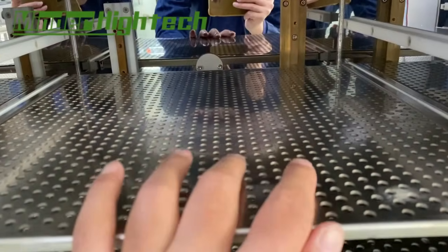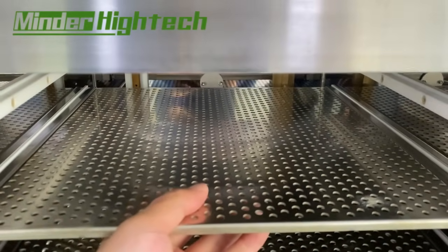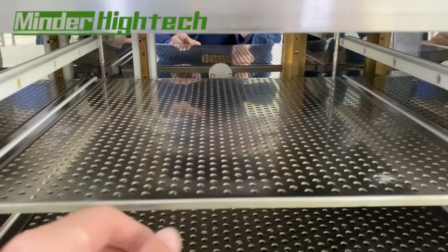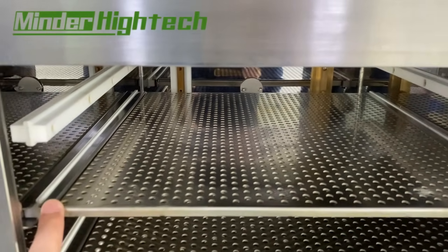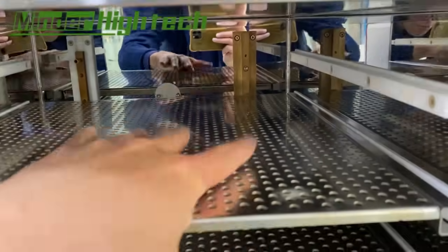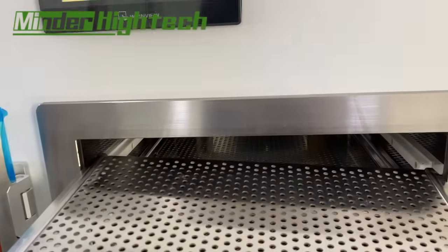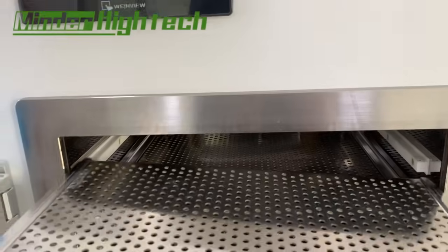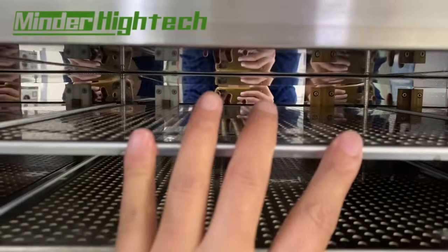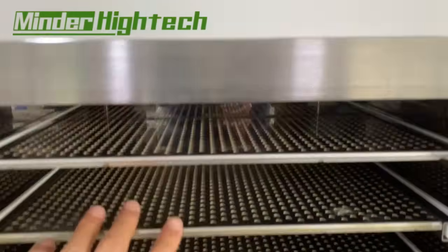If we do not use all of the layers — if we want to remove some layers — we need to make sure the arrangement is always one positive, one negative. Otherwise it might not work properly. When inserting a layer, make sure it is properly connected.